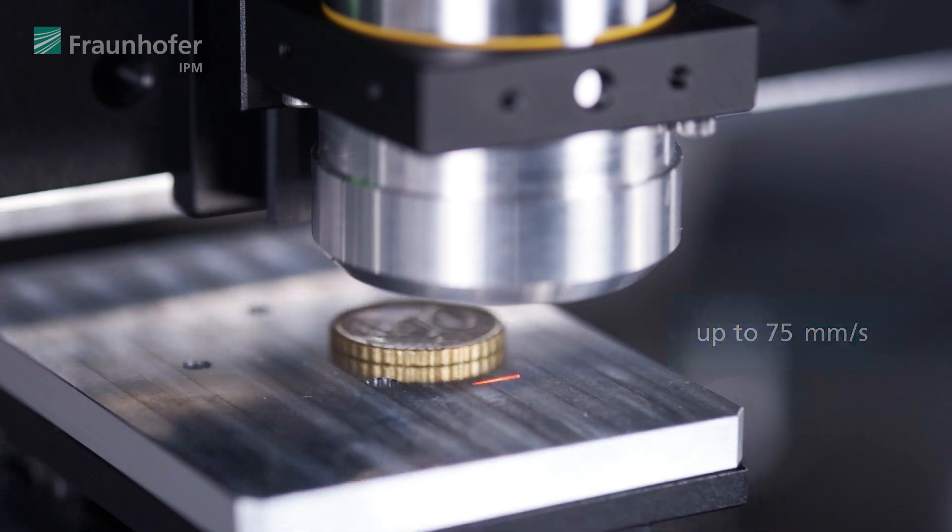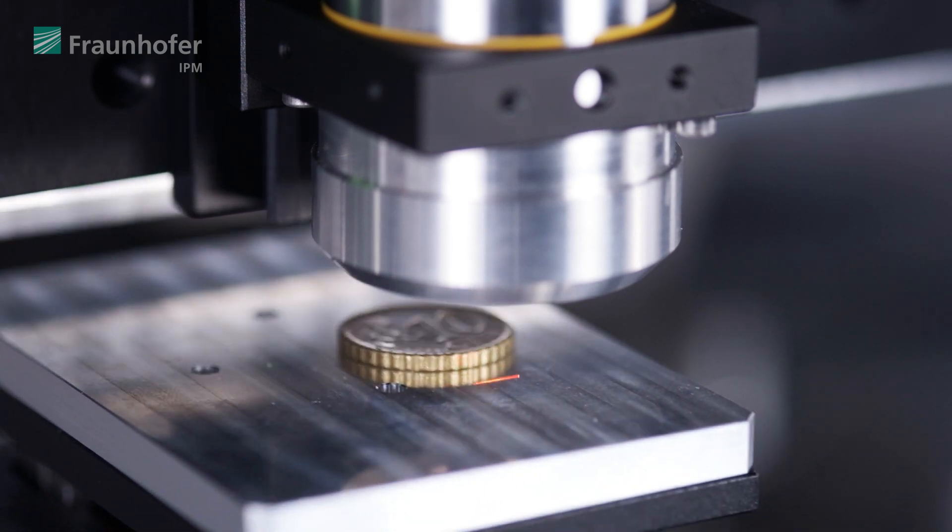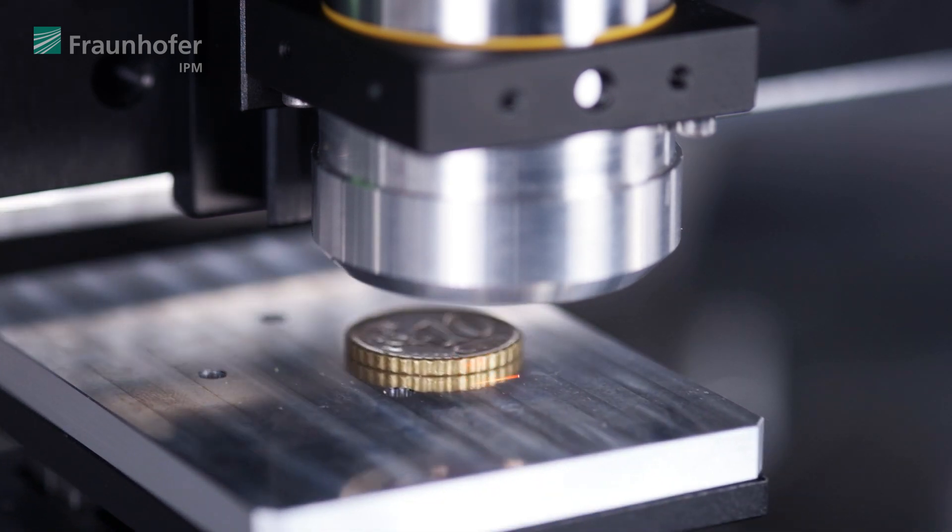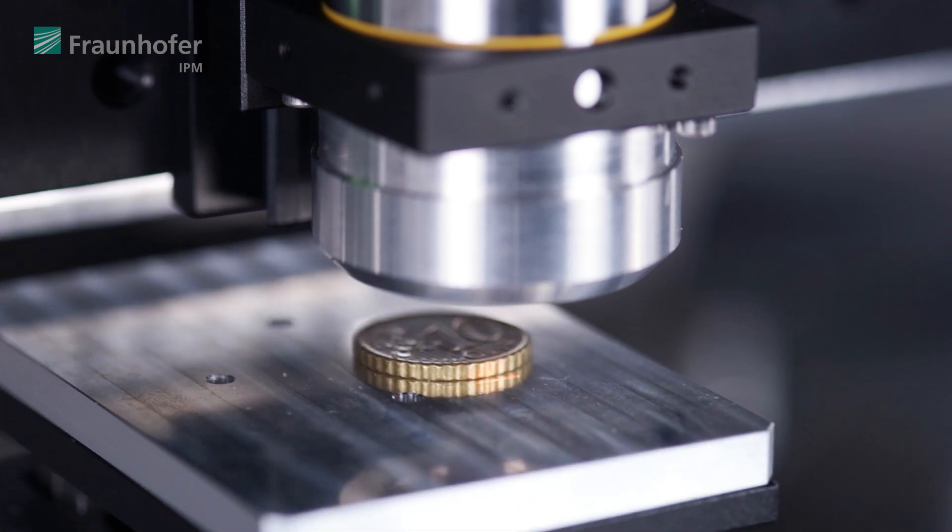Here on the bottom you can already see a measurement going on. However, it is important to note that this is slower than the speeds we use for actual measurements. Later on, we'll show real-time measurements which are quite fast.